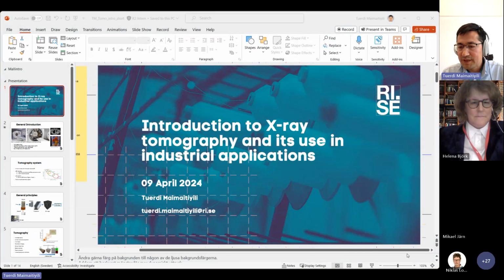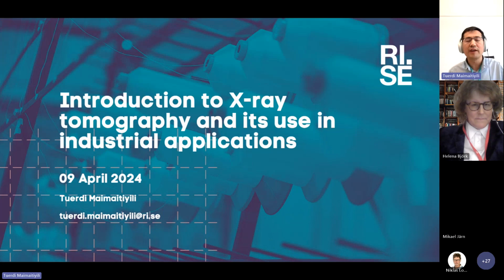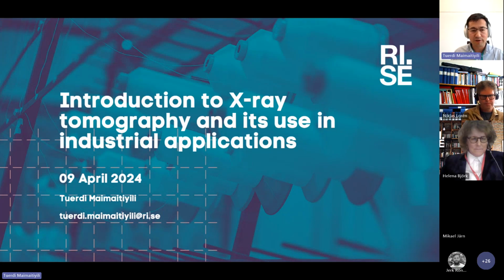Okay. So in the next 20 minutes or so, I will give a very brief introduction to tomography and its industrial applications, while having a short stop at the large-scale research infrastructure (LSRI) based imaging techniques, with some industrial case examples.